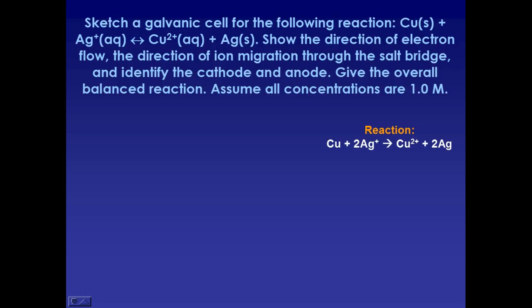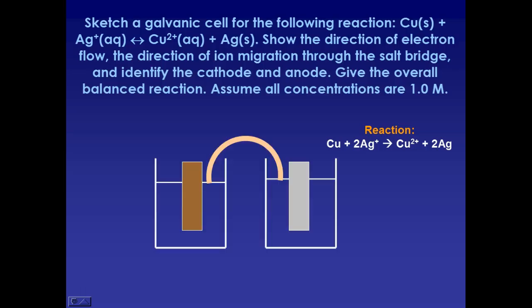So I didn't ask you to sketch a cell, but this was one between copper and silver, and I just thought that might kind of help you see what was happening in your lab. You do not have to do this for any part of your lab. So if you don't want to watch this, you can scoot right on through it.